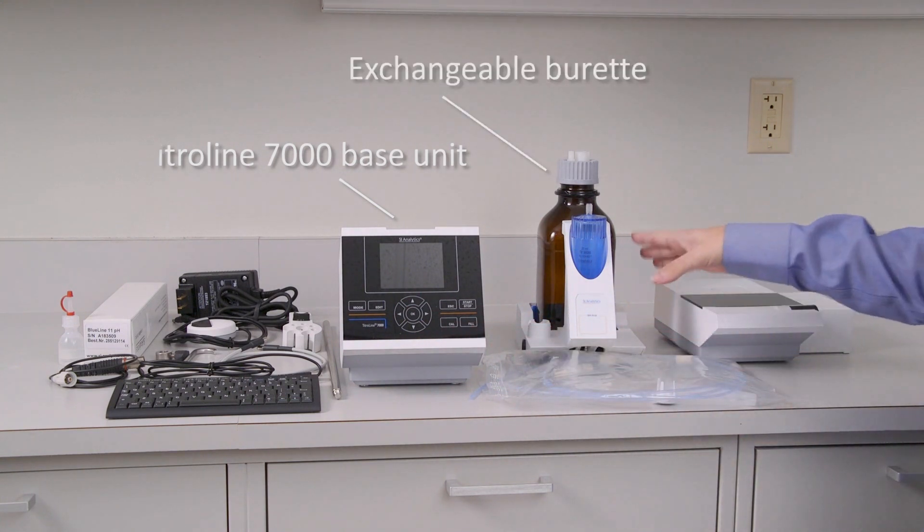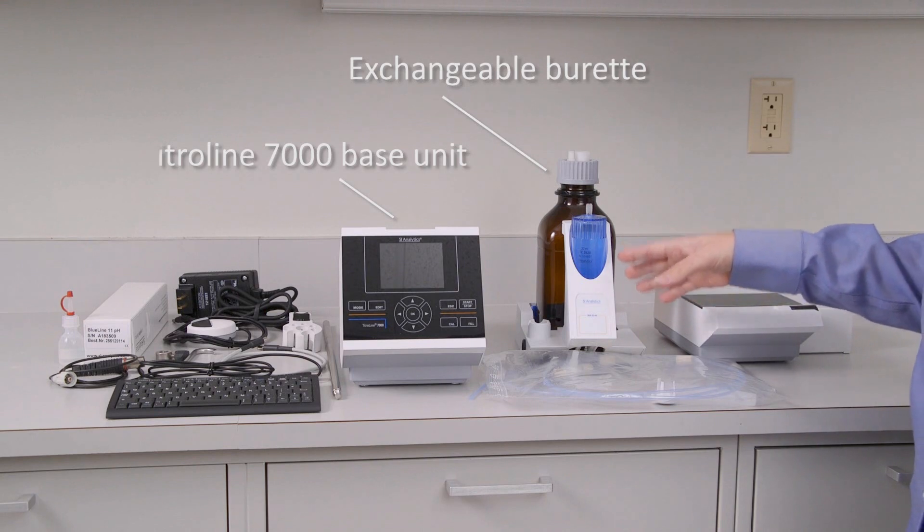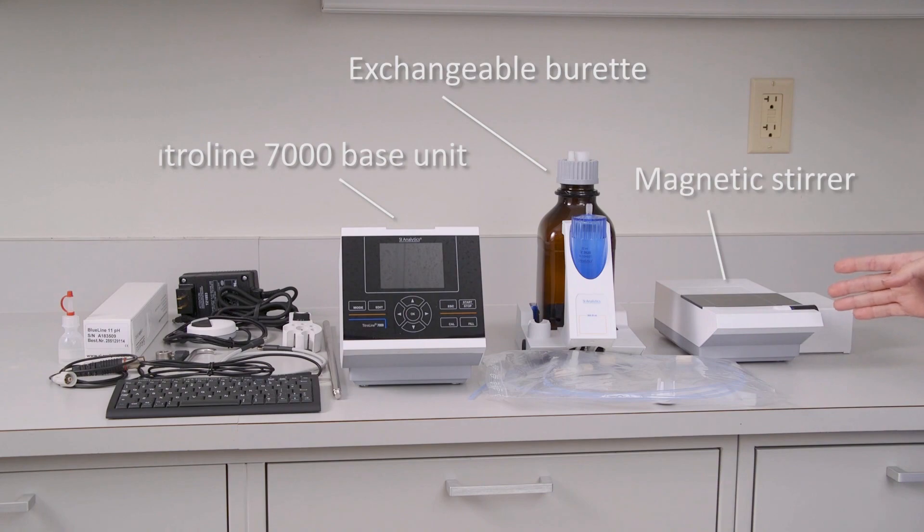The next part is the exchangeable burette. So this is the slide on, slide off, modular burette option that we offer, and all the tubing comes along with that. The final portion is the magnetic stirrer.